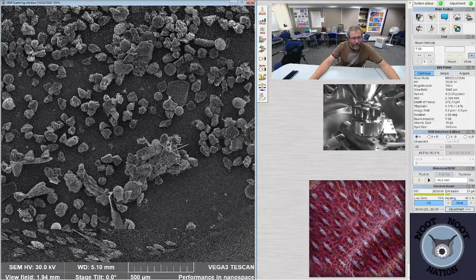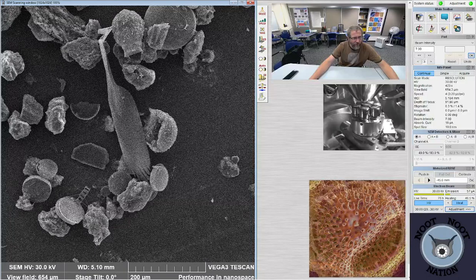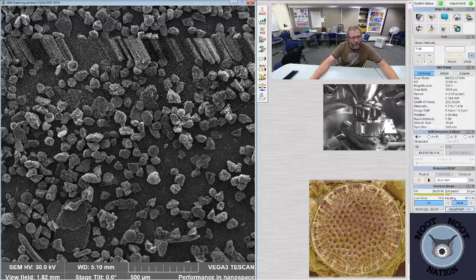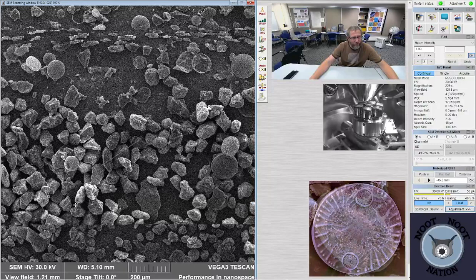You know what? There's a little chain. I saw some Bacillaria, I thought, in the live material that I looked at in the light microscope earlier. Maybe we should try to see if we can find some of that. We're always so zoomed out looking at the really large stuff because there's so much of it. Let's see what's on 3.